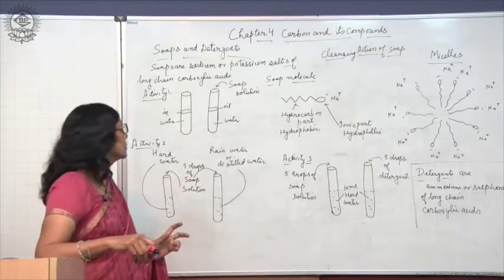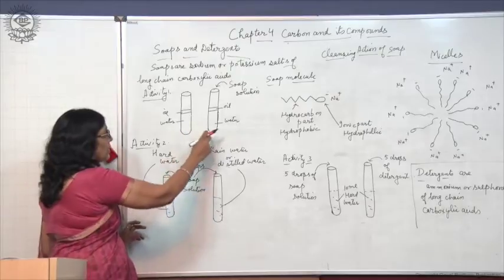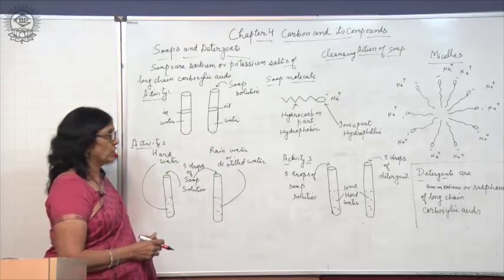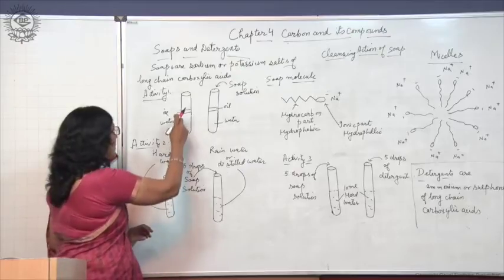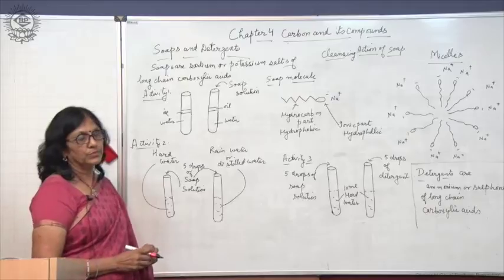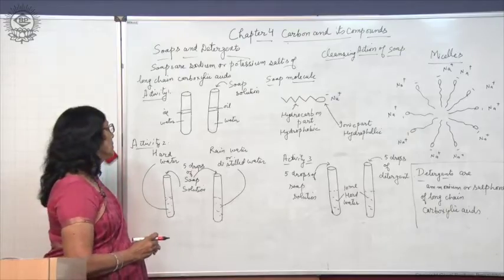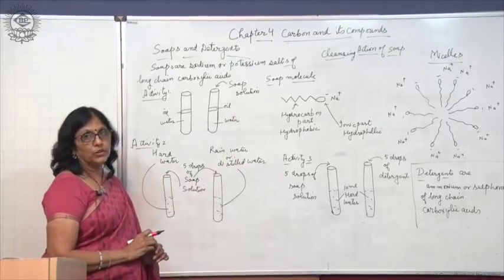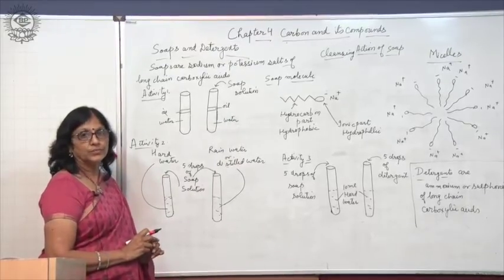The first one is, take two test tubes and in the test tubes take equal volume of water and add equal volume of oil to both the test tubes. What do you observe? That oil forms a separate layer because oil does not dissolve in water.